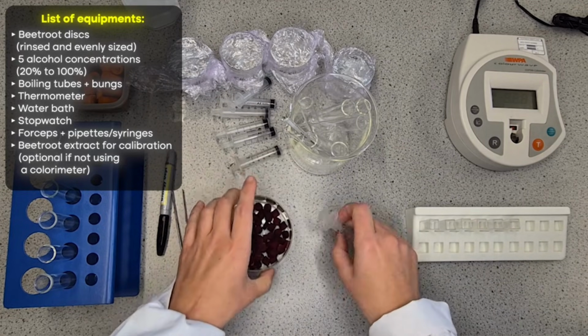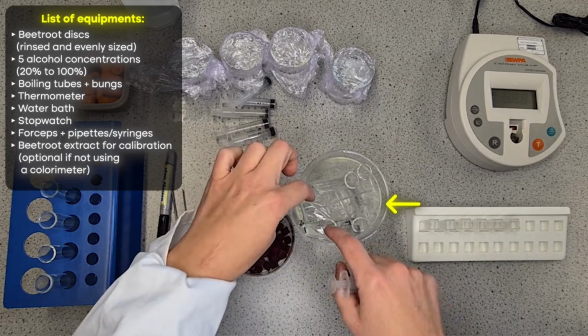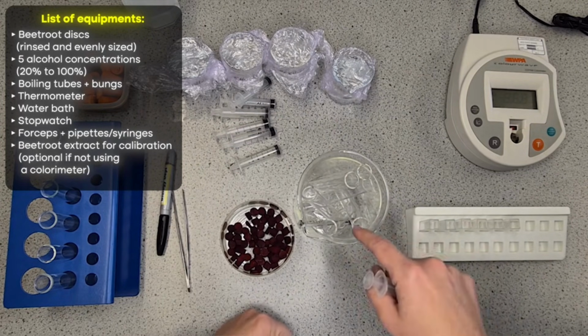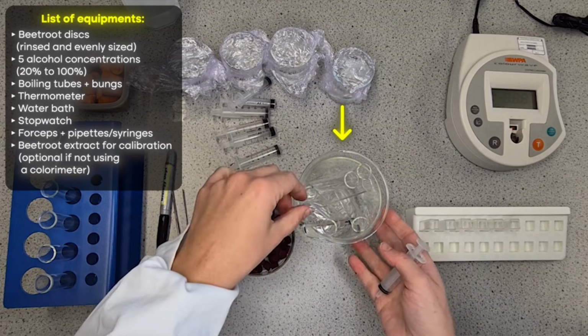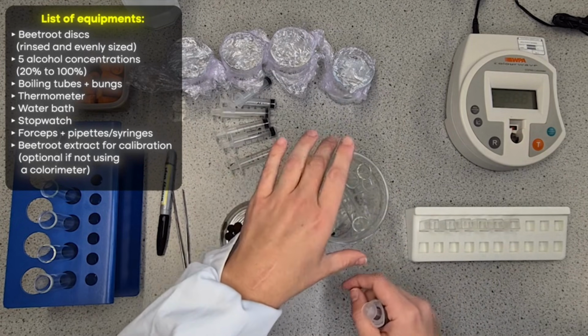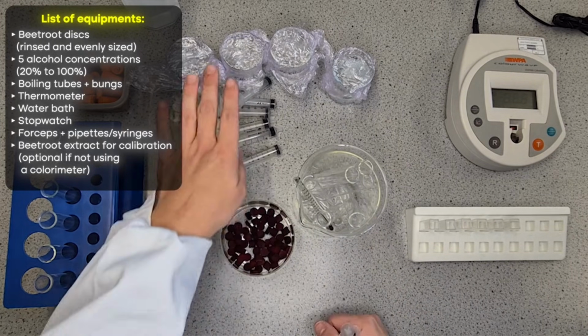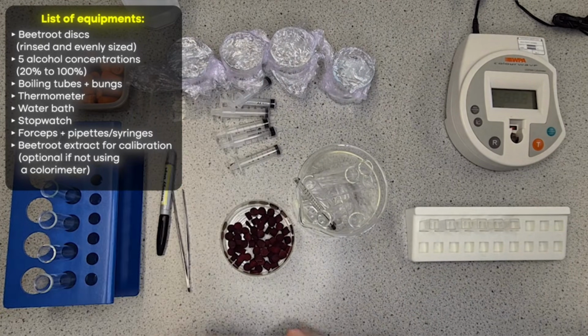I've also then got my test tubes here where I'm going to place the beetroot discs with the different concentrations in each test tube of ethanol, and a larger beaker with a thermometer, because that's going to be my water bath, because I'm going to be controlling the temperature as well, because I only want to know the impact of the different concentrations of ethanol.